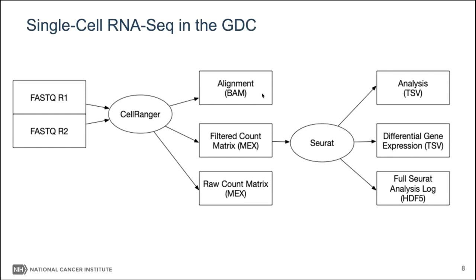There could be some other barcodes that are there. They could be associated with free-floating RNA or a cell that was lysed and maybe attached to two barcodes. But the filtered count matrix is the one that's safest to say is associated with actual single cells.